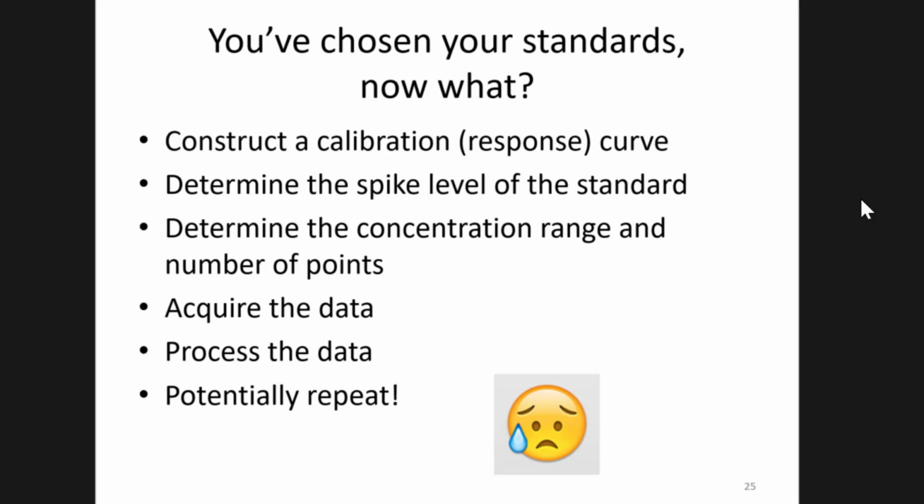I don't know what the labeling efficiency is, but if you have a protein or a bunch of light peptides, you can label them with one form of the TMT label and have those as your standards, as long as you label your sample you're going to analyze them in with another form of the TMT. I know people that do that. I personally haven't. It's potentially a more expensive route because of the cost of TMT, but it does give you the flexibility of getting a heavy peptide, like any heavy peptide.